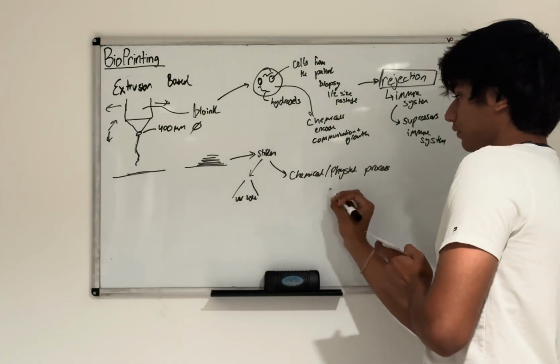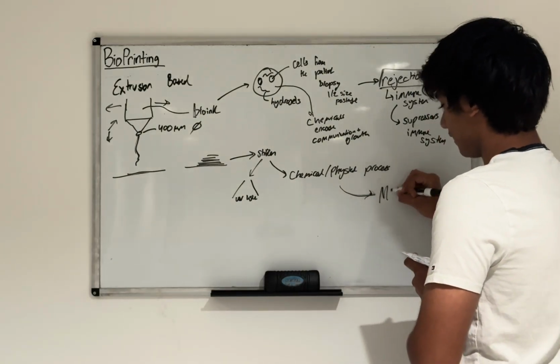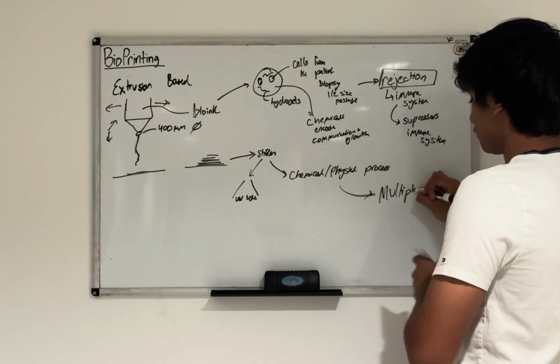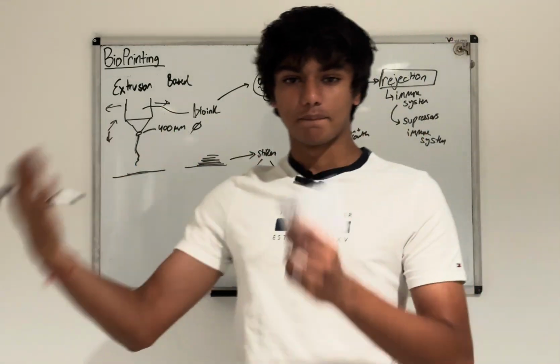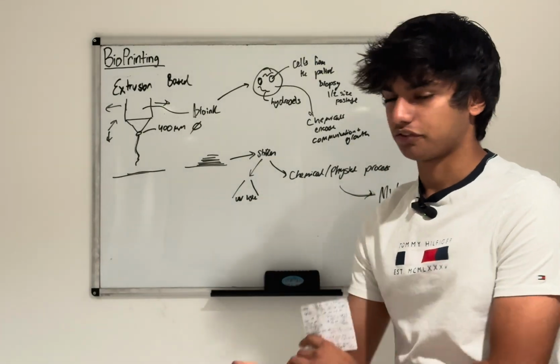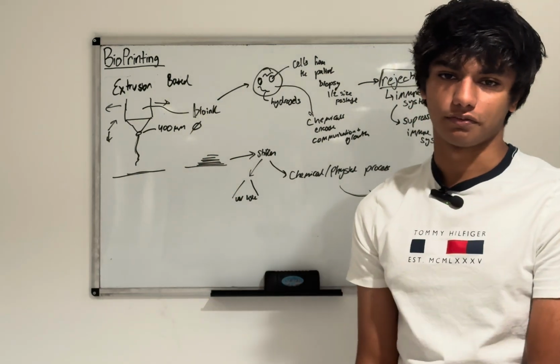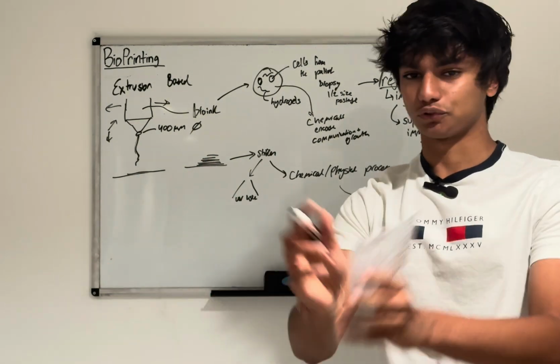Oh yeah, but you also need to wait for it to multiply. So after this process, you have to wait for the cells to multiply and to actually create the tissue. Because what you're doing is setting up basically the base of whatever you're creating, and then the cells actually have to multiply and do most of the work once you've created the structure for them to multiply in.